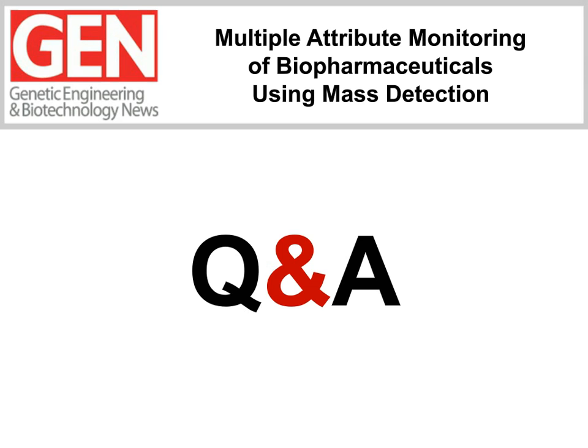All right, and it looks like we have time for just one more question. Our audience member would like to know, if the QDA can do what's similar to the G2, why would a customer buy an instrument like the G2? Okay, so that probably refers back to the comparative data that I had shown, the QDA versus the SYNAPT data.